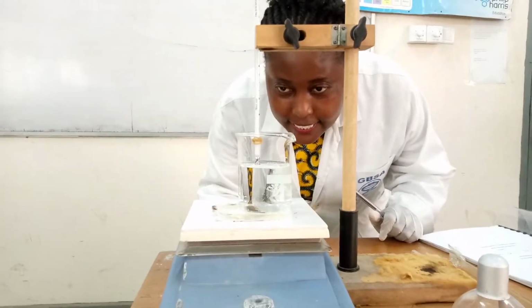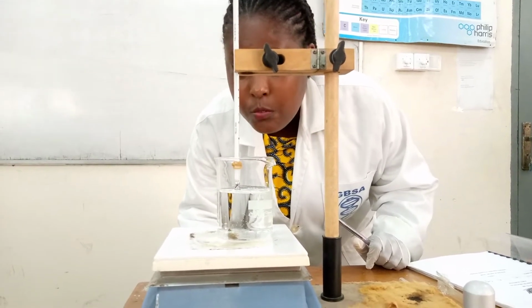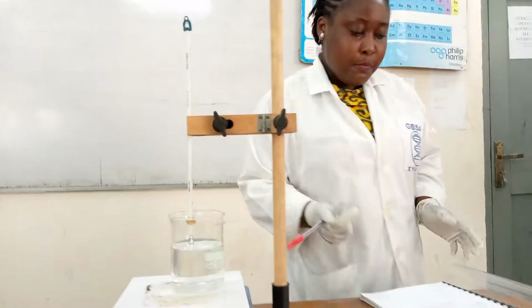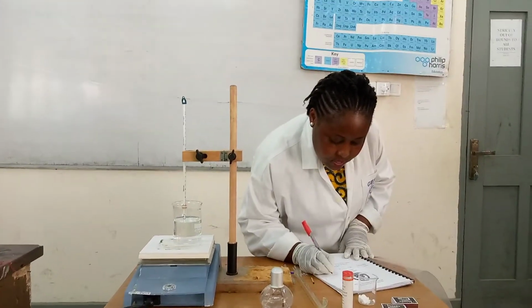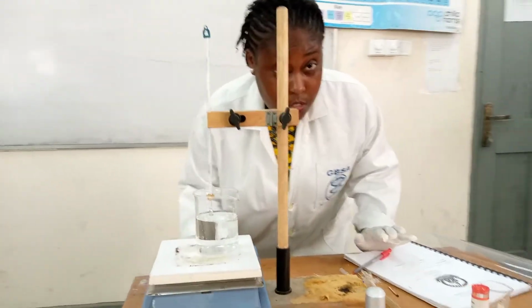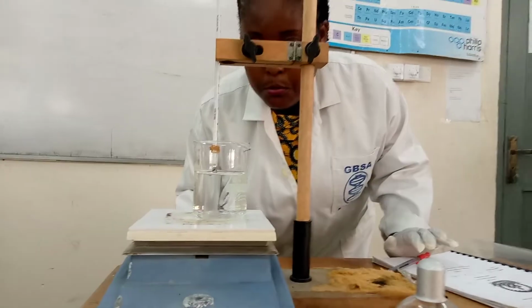Okay, so I'm checking. It's about to melt from the bottom. So the temperature is 121. So it has begun to melt at a temperature of 121 degrees Celsius. So I have to wait. You know, the paraffin oil was already on. It was heating. So now we will not spend much time melting our sample.